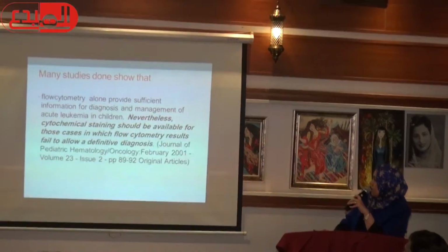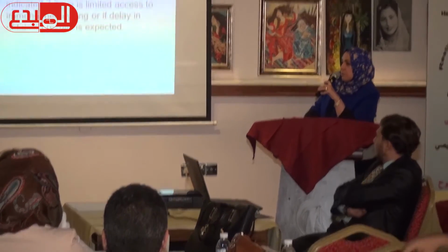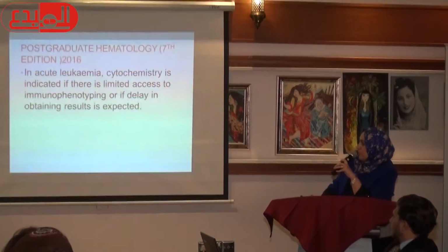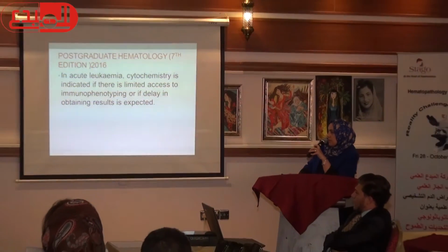This quotation is from the Journal of Pediatric Hematology and Oncology. Our textbook, Hoffbrand's Postgraduate Haematology, 7th edition, 2016, says that in acute leukemia, cytochemistry is indicated if there is limited access to immunophenotyping or a delay in obtaining results is expected.